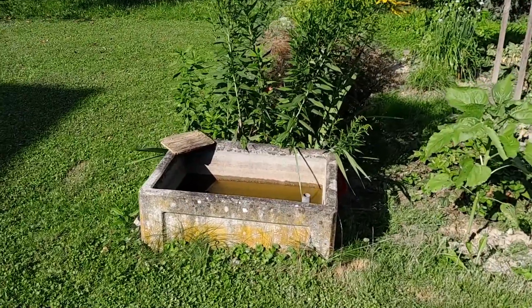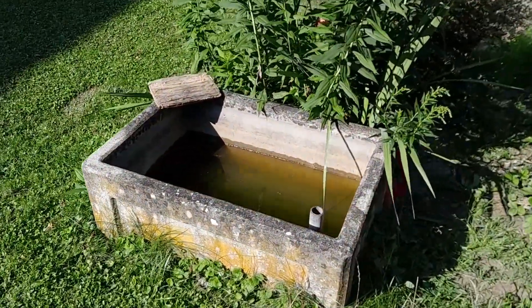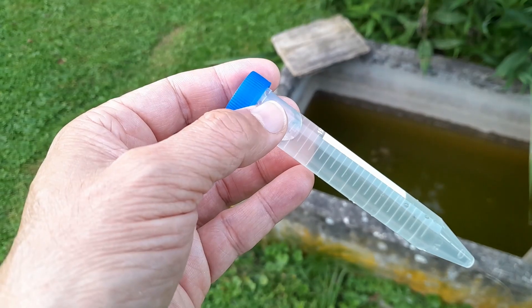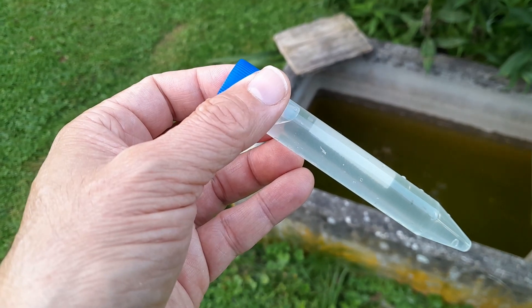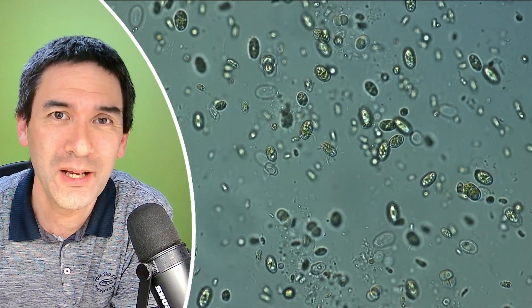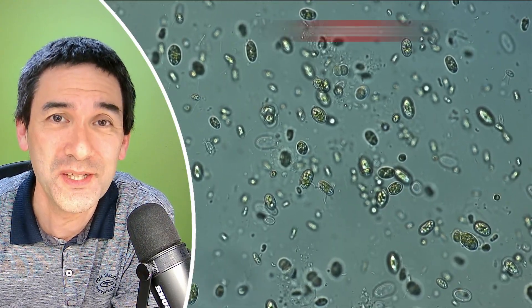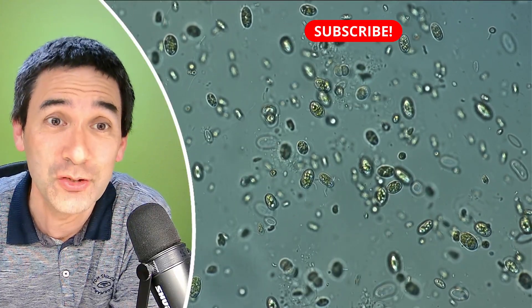I want to share with you another water sample that I collected today — and not only that, the power of the centrifuge. That's the title of this video. Today I want to share with you another water sample here. Look, plenty of cells are visible here: lots of bacteria, protozoans, also algae.